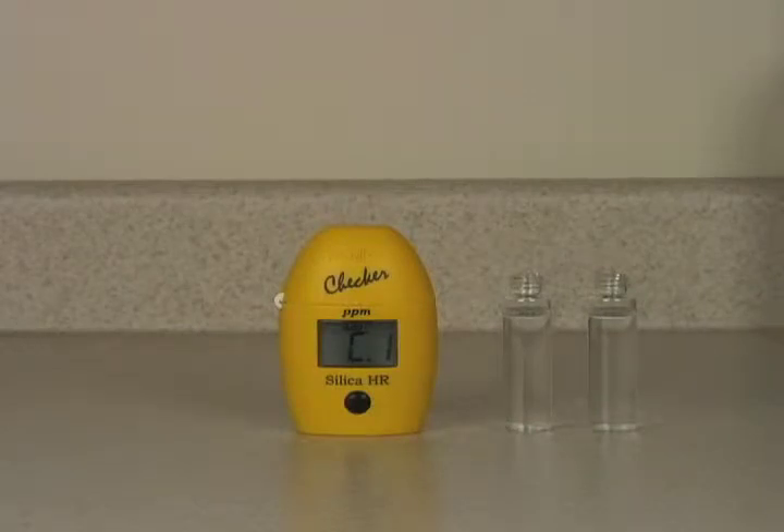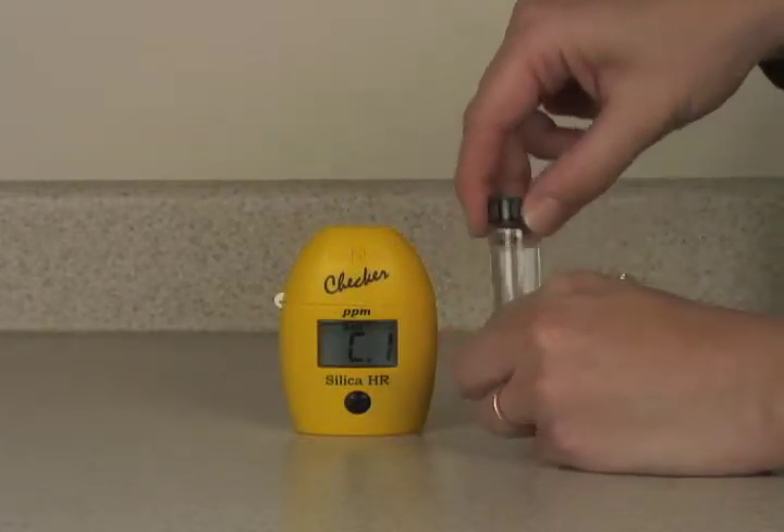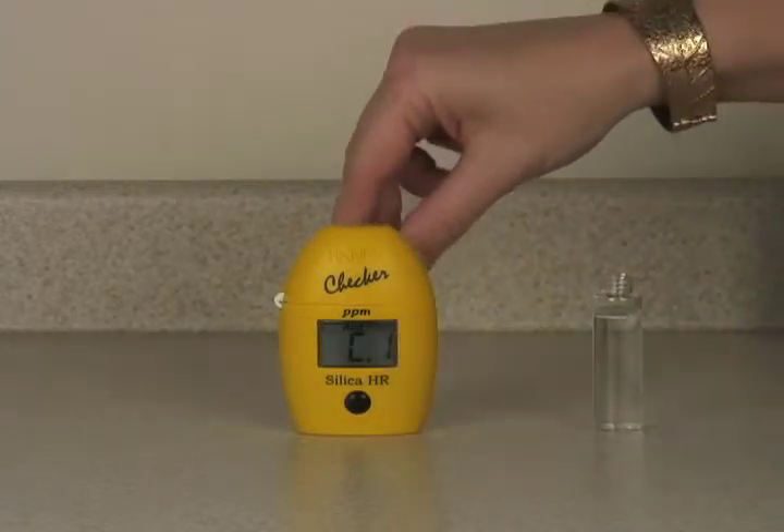Today we're going to do the test for silica, the HI-770 checker. We have two cuvettes of unreacted sample that fill with 10 milliliters each. I use just plain tap water. We're going to put the cap on one — that is our blank — so we'll set that aside.